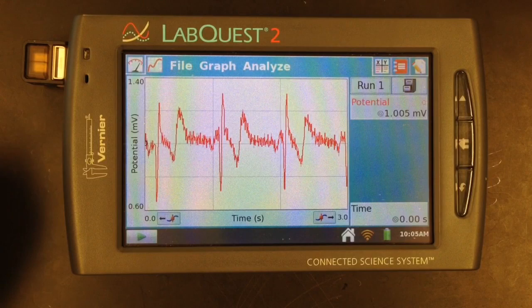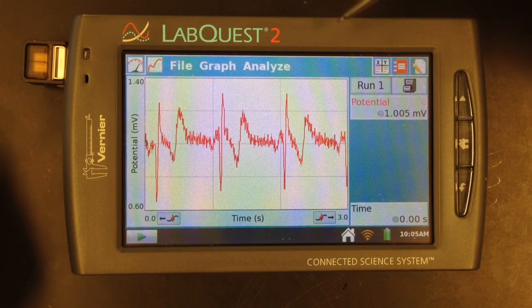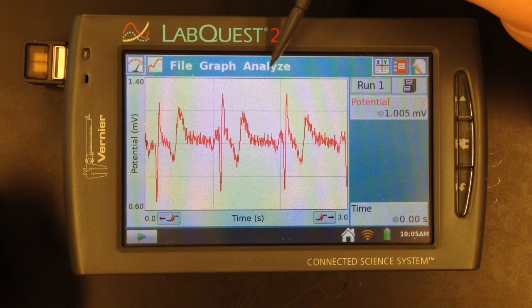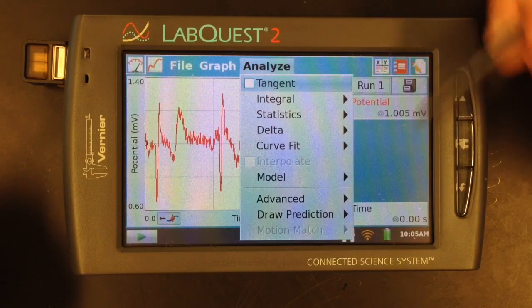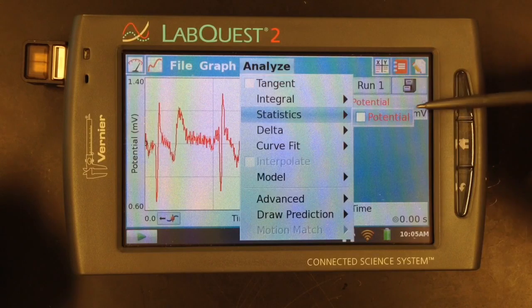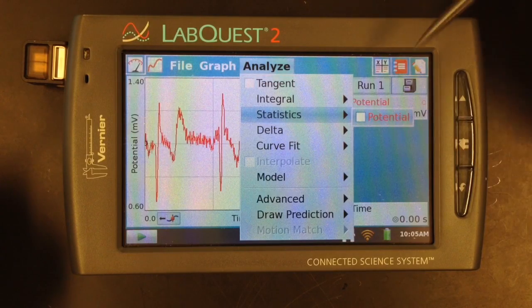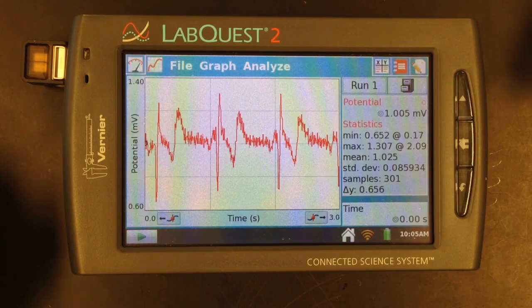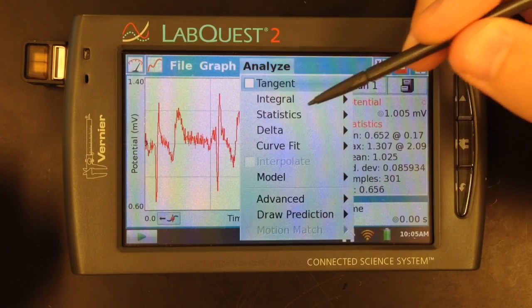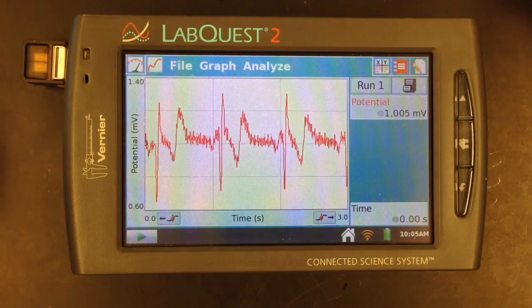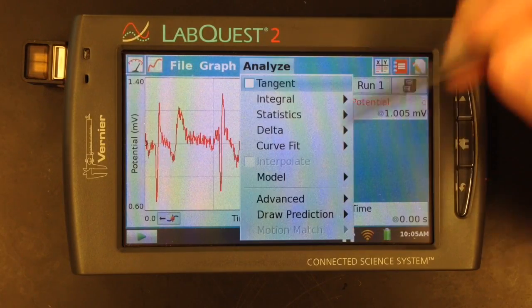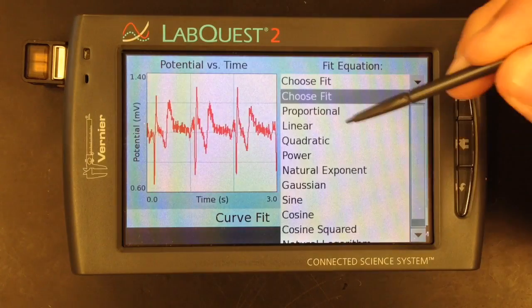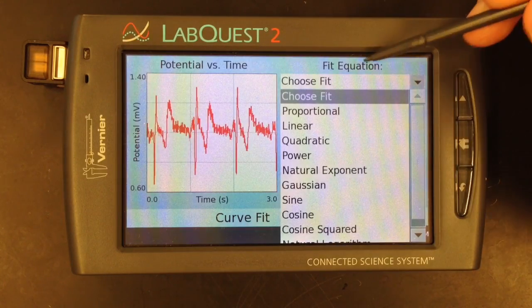To show you some of the other features in the graphing tab, I've loaded previously recorded EKG data. The first feature is statistics, which is located under the analyze option. If you had multiple runs, they would all show up. You select which ones you want to add the statistics to, and then the values appear on the right-hand side. To remove them, it's the same option — just unchecking. You can also select a curve fit for your data, including linear, quadratic, and various other options.